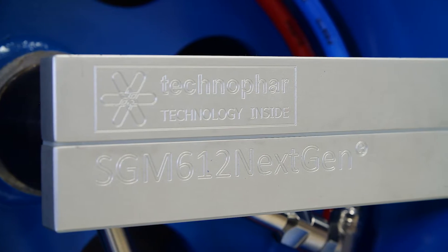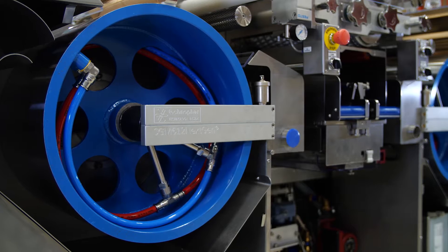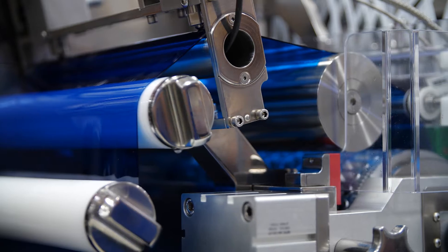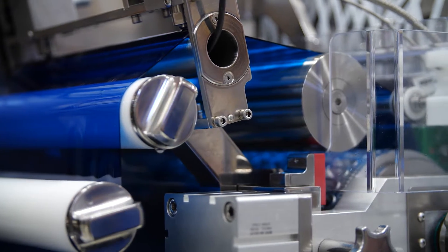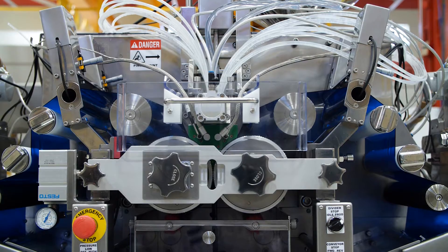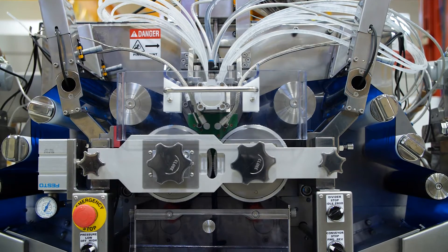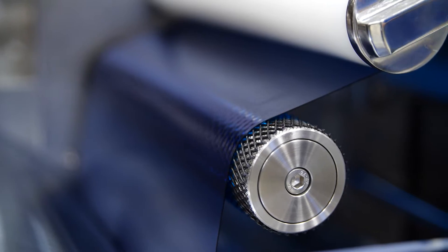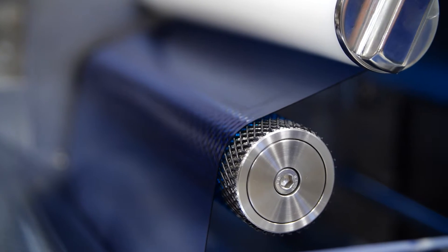The SGM 612 NextGen allows for improved access to all sections for GMP cleaning. The performance of the machine provides a maximum speed of 8 rpm, with standard running speeds of 4.5 to 5.5 rpm for suspensions and pastes, and 5 to 6.5 rpm for standard oils.